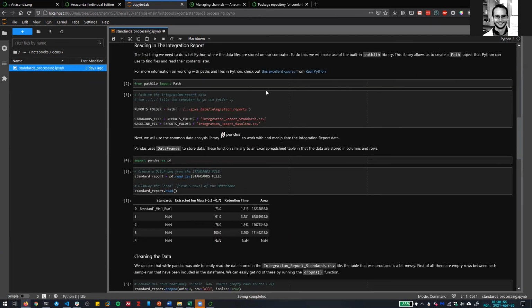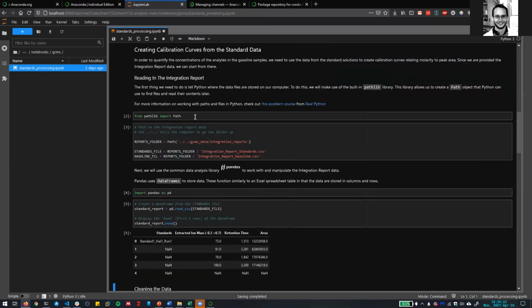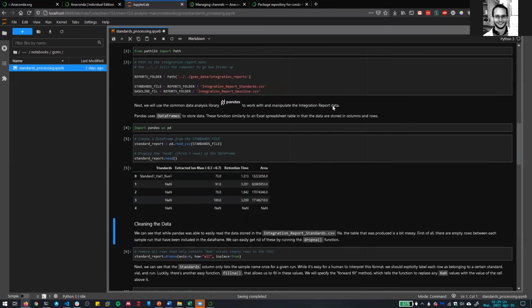So Richard, did you go through and run the cells in order? One of the downsides of Jupyter notebooks is you can get your state, what's called your state, kind of messed up if you run things out of order. But if you go through and run each thing in order, and make sure that they're imported correctly, then that works for me once I run there. But you need to make sure that you run all of the code cells in the order that they're in the notebook.